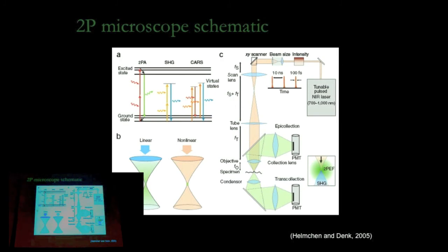I'm just saying, you put a photon into the objective, there's a 70 to 90% chance it'll make it out, depending on the objective. I'm worried that the photon goes in all directions. The collimation properties are different, but typically those are pretty good. But it's typically absorption events inside the objective where you would lose light, rather than scattering.